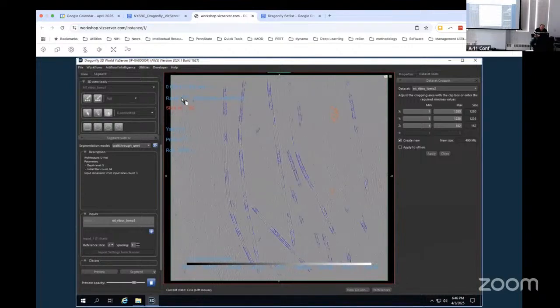Sorry, I got thrown off my slice. Okay, all right. What happened to my microtubule? Oh, there it is. Those are on slice B1. Appreciate it. I thought I forgot I moved it.